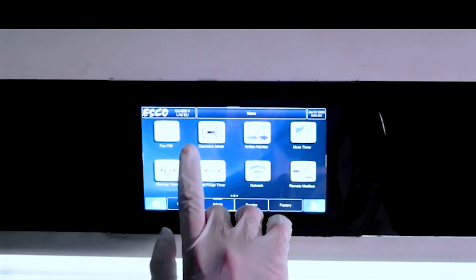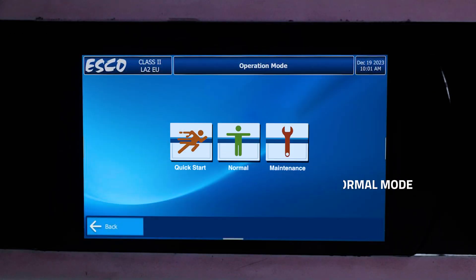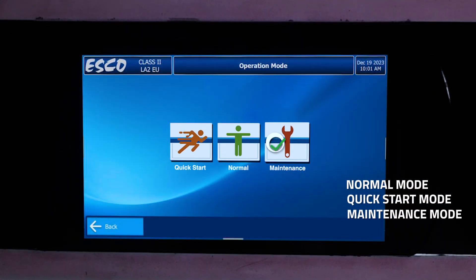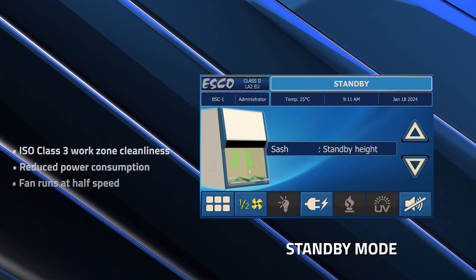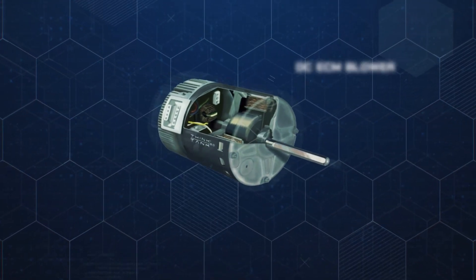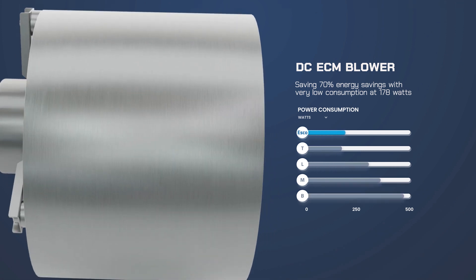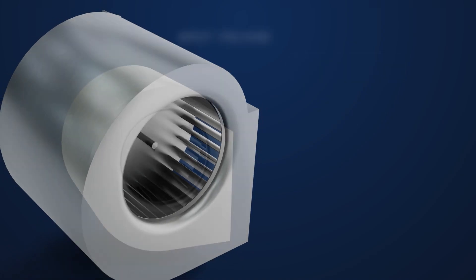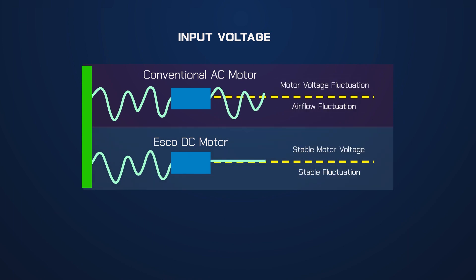The ESCO LA2EU G4 has specified modes for accurate functions: normal, quick start, and maintenance mode. Standby mode maintains ISO Class 3 work zone cleanliness while the fan runs at half speed. The DC ECM blower enables a remarkable 70% energy savings, consuming a mere 178 watts, as it incorporates an auto compensation feature to ensure consistent airflow.